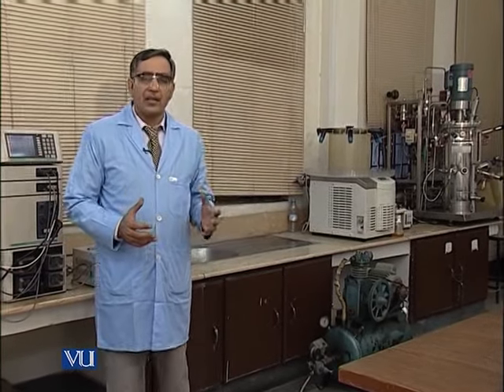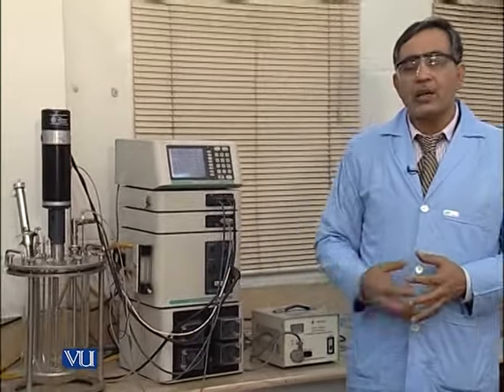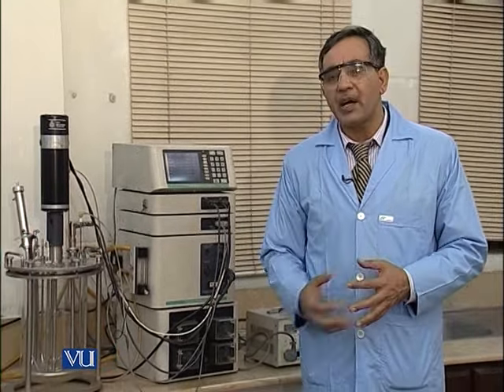So, just keep in mind and remember your module in which we were talking about the differentiation between the lab scale fermenter, pilot scale fermenter and industrial scale fermenter. In this laboratory, we have two fermenters. This side is a lab scale fermenter, 7.5 liter is the maximum capacity, and the working volume, if we use 75% of the total volume, will be 5 liter.